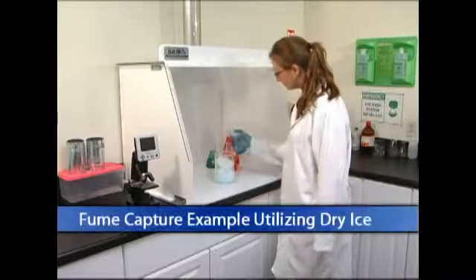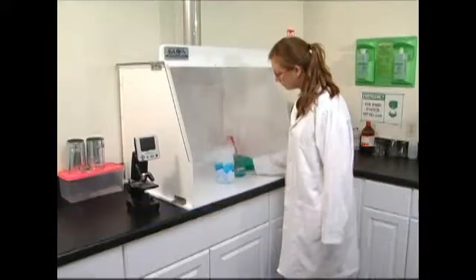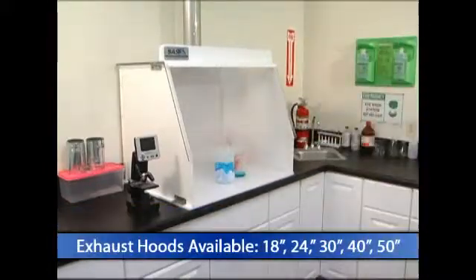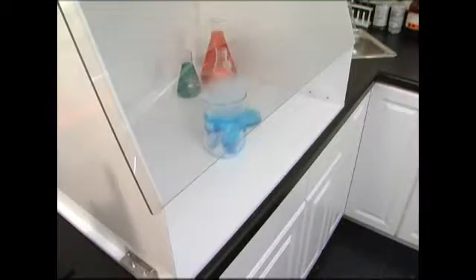Sentry Air Systems offers a high quality line of exterior ducting exhaust hoods in a variety of sizes. Units are available at 18, 24, 30, 40, and 50 inches wide. Custom hoods can also be engineered to customer specifications.